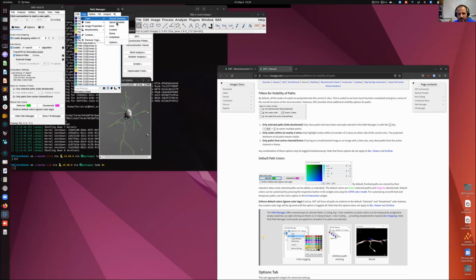So you can tag them, you can say what they are, if it's an axon, a dendrite. You can assign them by channels. You say, this one belongs to channel 1 if you belong to the channel image. Or you can assign colors. In this case, you can say this one is red, and red could mean to review. You can type in your own tags, like you can say problematic segmentation or something. I can say problematic, that idea. And the idea is that you can then use these to access them and do operations on them.